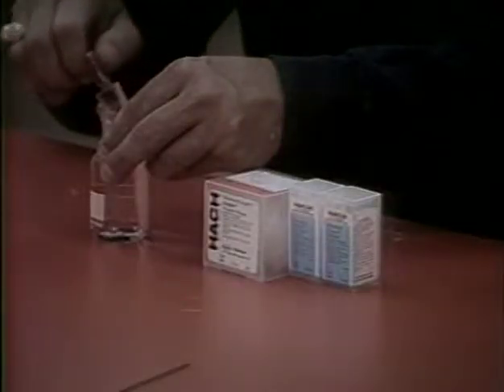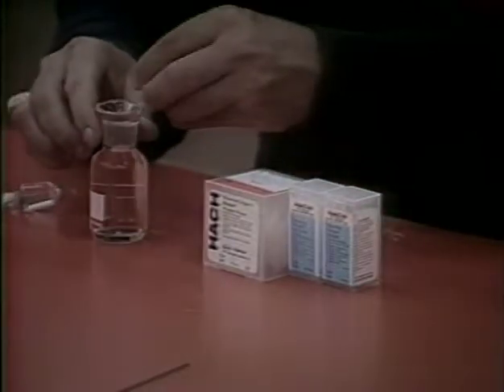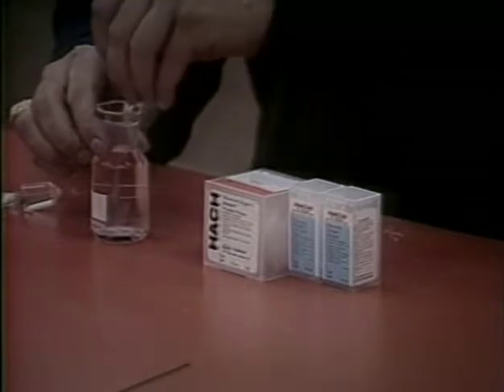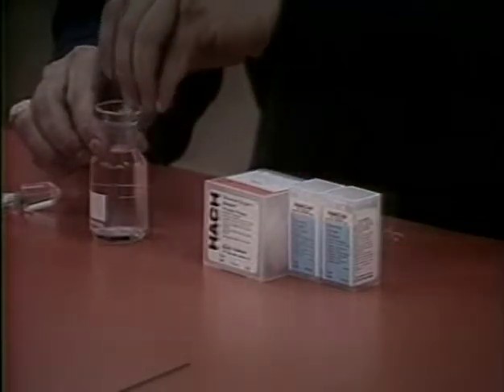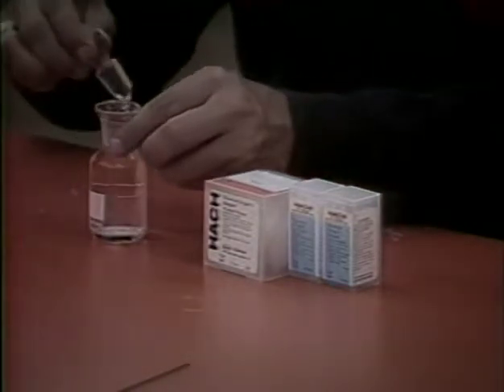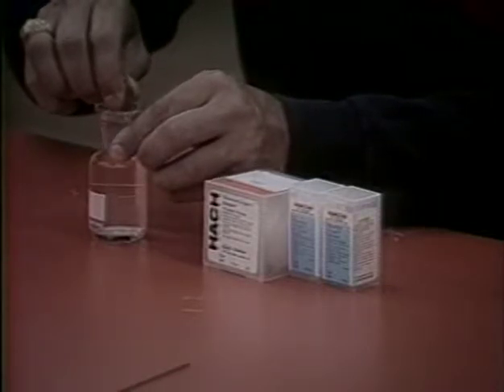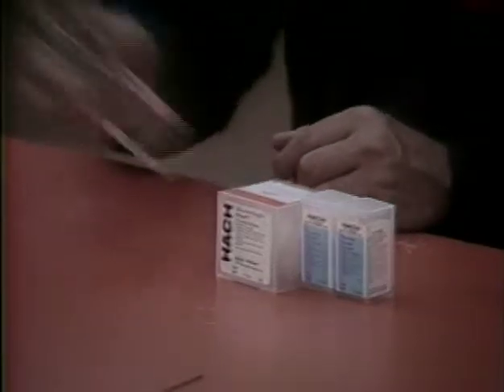Carefully remove the stopper from the bottle. Add the contents of 1 dissolved oxygen 1 reagent powder pillow and 1 dissolved oxygen 2 reagent powder pillow to the bottle. Stopper the bottle firmly to avoid trapping air. If air bubbles are present, discard and obtain a new sample. Shake the bottle vigorously for a few seconds to mix.